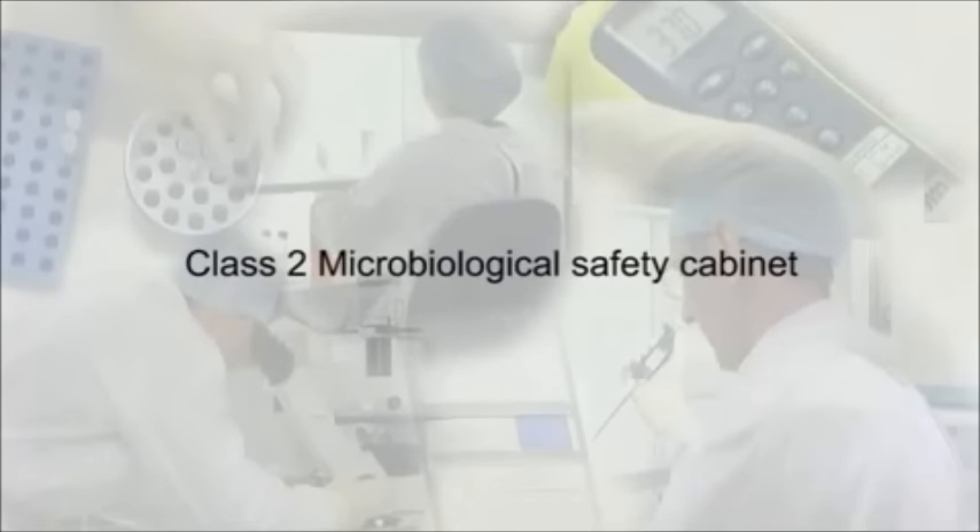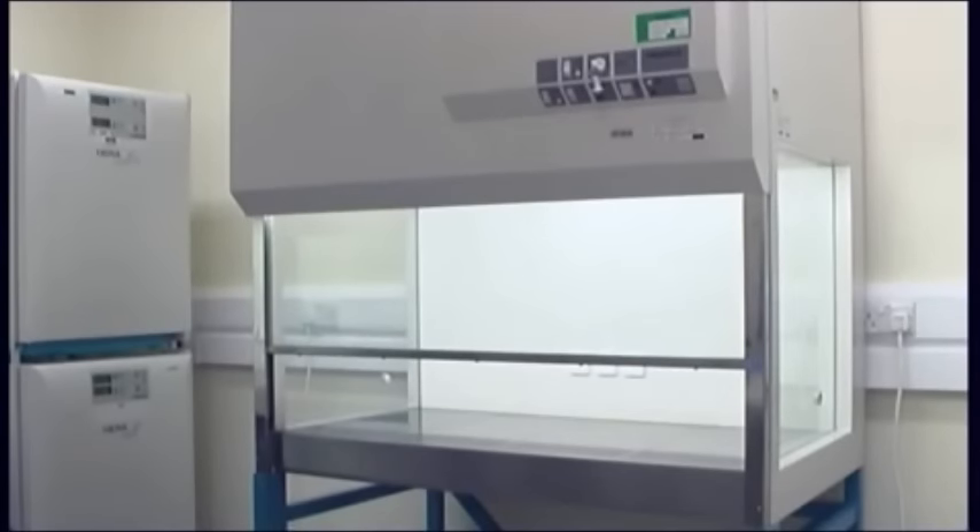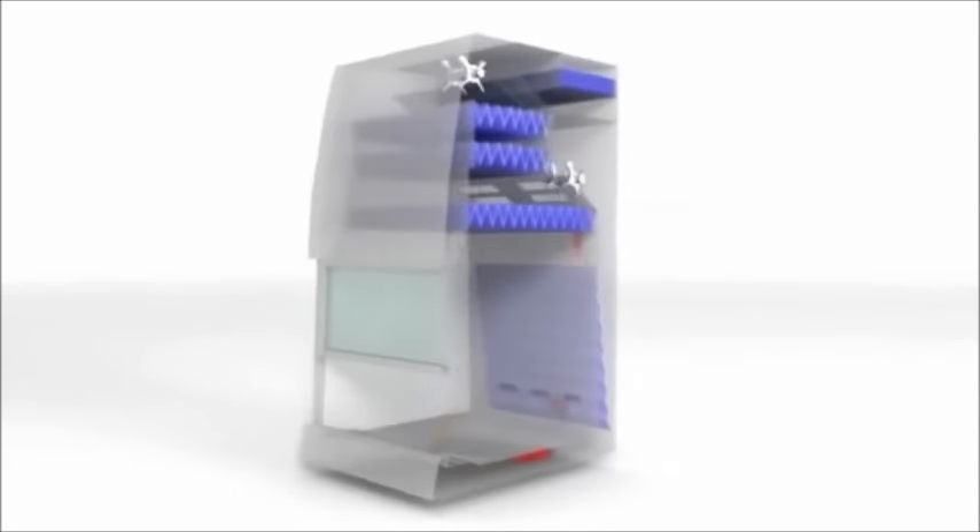Microbiological safety cabinets, also referred to as MSC2 cabinet or hood, are probably the most important piece of equipment for cell culture, since when operated correctly, it provides a clean working environment whilst protecting the operator. Operator and product protection is provided through a combination of airflow, negative pressure and HEPA filters. Cabinet exhaust may be ducted to atmosphere, or recirculated through a second HEPA filter back into the laboratory.